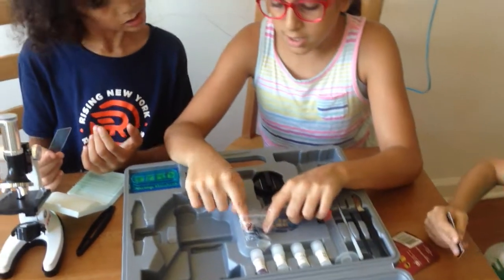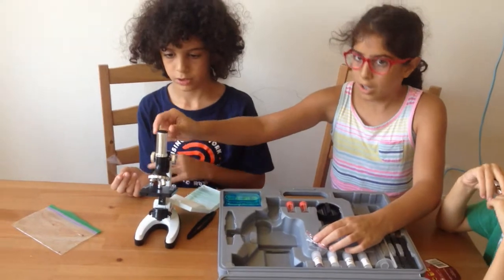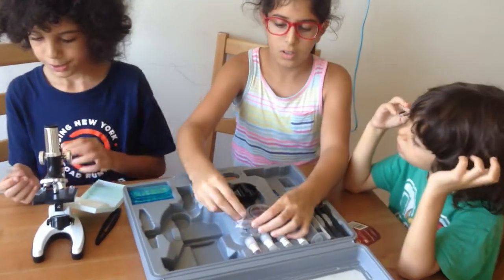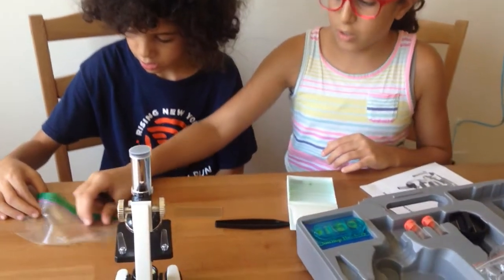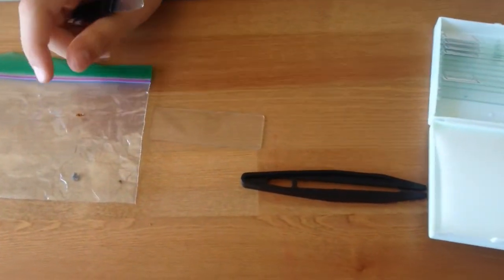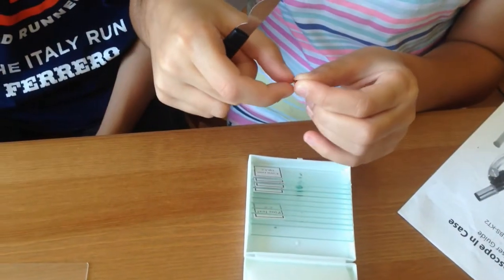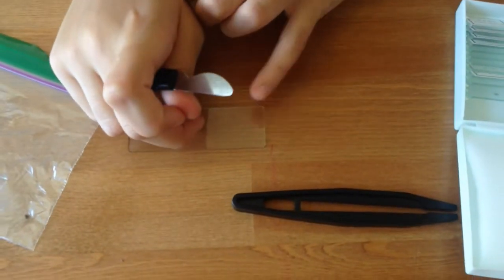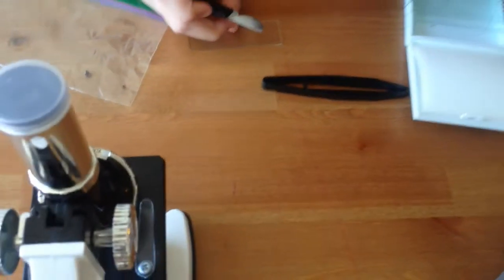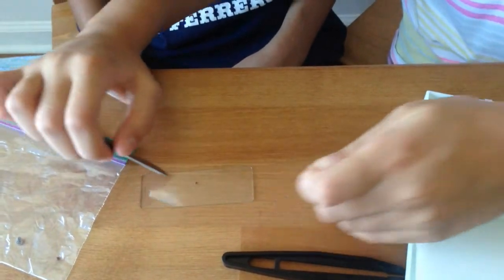That one was just sleeping. There's this thing in here, like another binocular thing that you stick on the microscope. Last but not least, the instructions. I don't know how to do this — it's in the instructions. Okay, so we have the ladybug wings over here, and it needs to be very thin and a small sample, not this big. The microscope does come with a knife, but I'm not sure if I should use it, so I'm just taking this teeny sample and trying to take it off my finger. There we go — now we'll just push it in with the knife. We have the teeny sample.